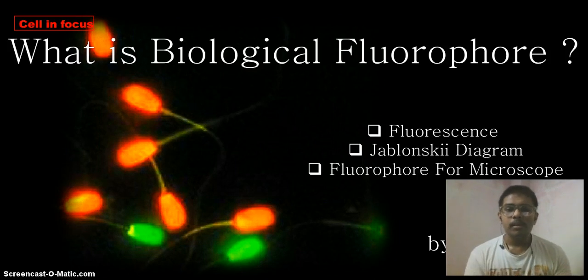And now let's say you have a phone call, and your phone is on the first floor. So you will come to the first floor. This phone call you can call excitation. And the ground floor is called the ground state of the electron, the ground energy level. And the first floor we will call the excited state.